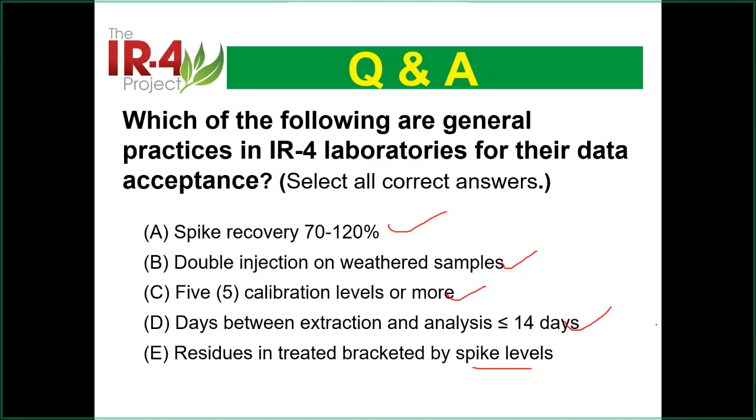So basically, this most likely is not the GLP requirement. It's related, but it should be the protocol requirement. And sometimes you may have a more restricted requirement in your lab, so you write it in your SOP.